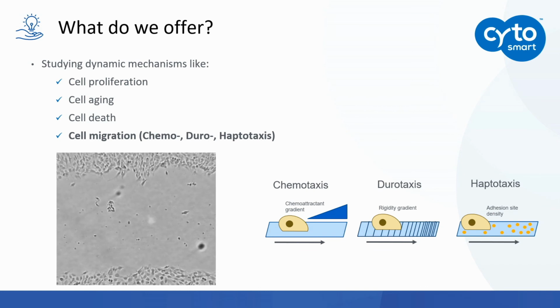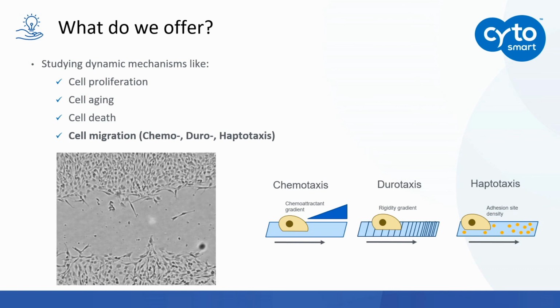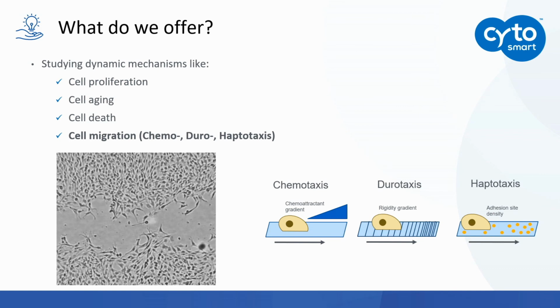And again, this process makes much more sense when you actually see the cells moving upon a certain stimulus instead of just looking at the pictures on the right.